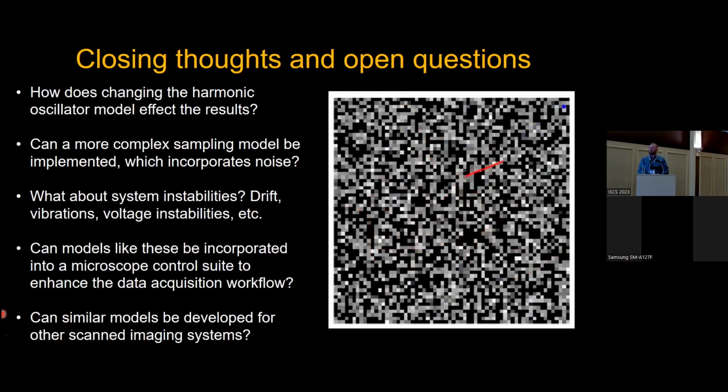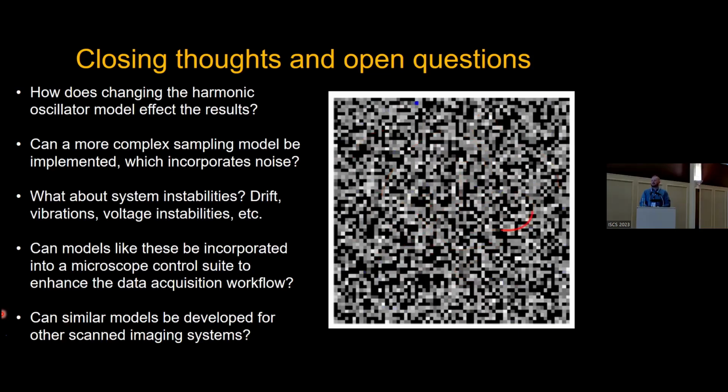Thank you. Naive question. Is it possible to have a super well-known sample, for instance a sinusoid pattern? Of course, it won't be like that for atomic structures, but let's dream of that, so that you can recover afterwards the location of the probes by the intensity that has been recorded at that location. Is that something possible?